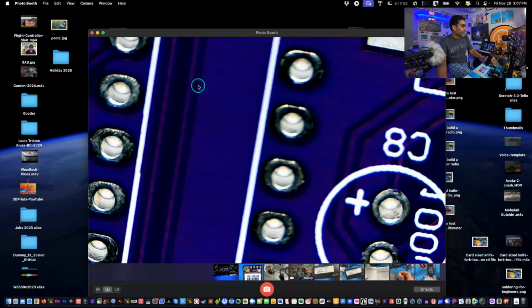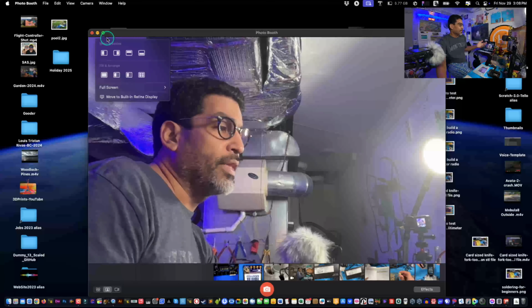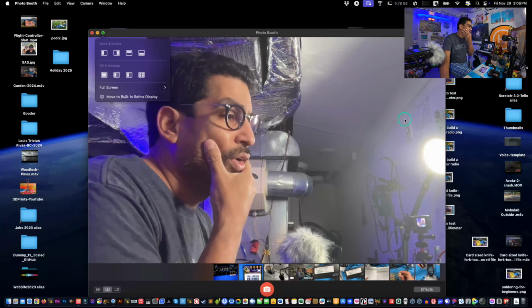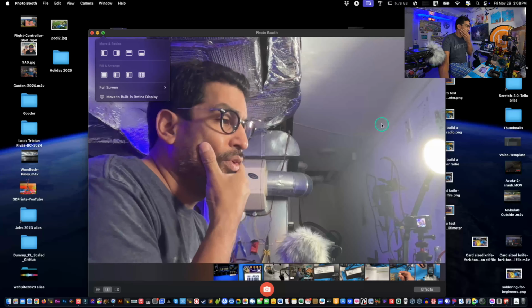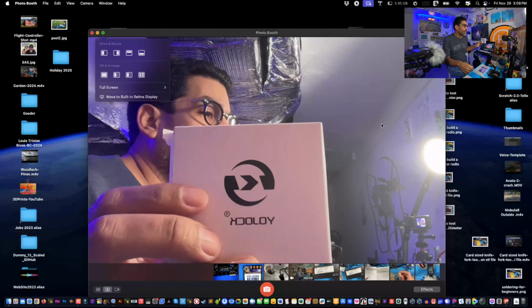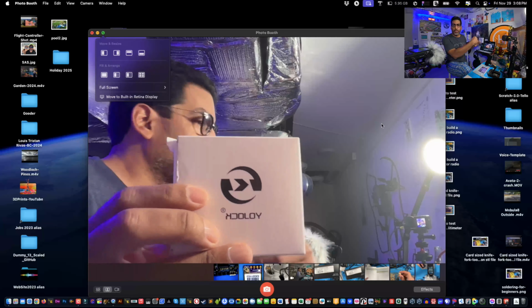But if you look here, if we go to a camera, let's say I want to see myself, and I can choose the FaceTime camera, and there I am, but I'm actually backwards, so even that can be confusing too. And as you can see the sign over there, it just doesn't work the way it's supposed to. And in case you're wondering, how do you know it's backwards? Because when we do this, see that? Can you read that? You can just put a mirror next to it, but we don't want that.